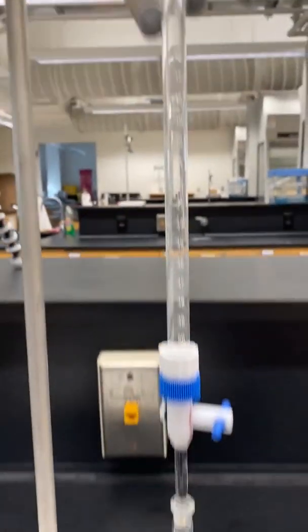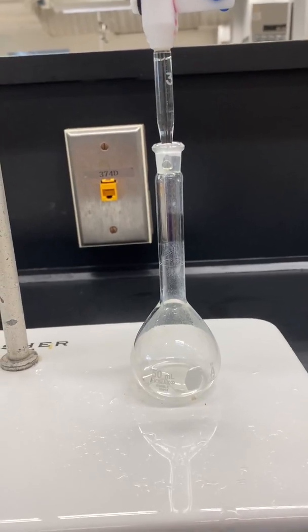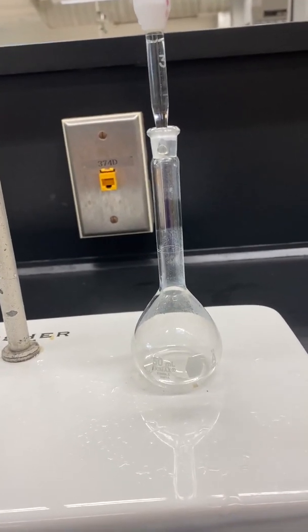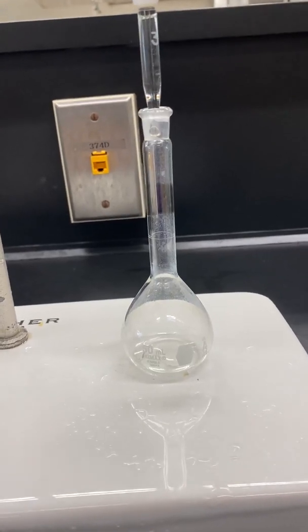For solution number B, we'll add 2 milliliters. For solution C, we would add 4 milliliters. For solution D, we'll add 6 milliliters. And for solution E, we'll add 8 milliliters.